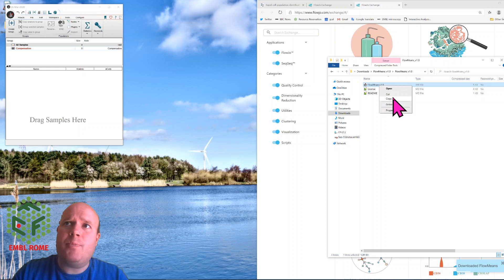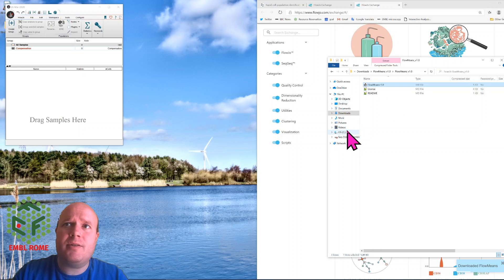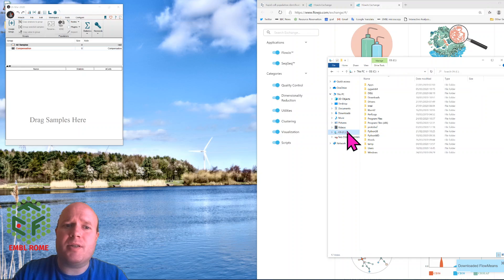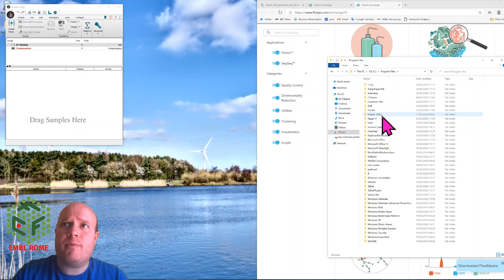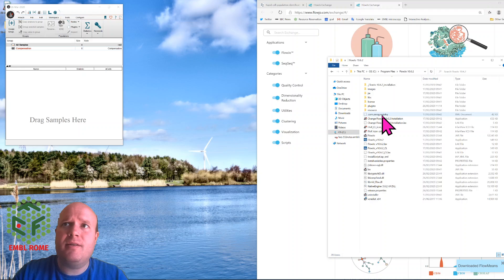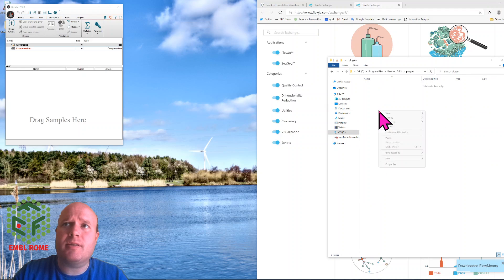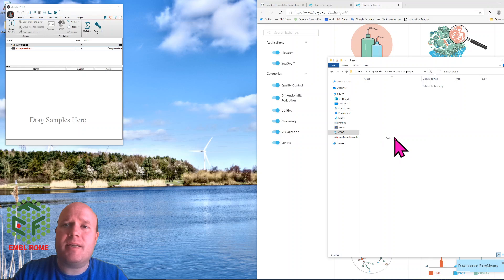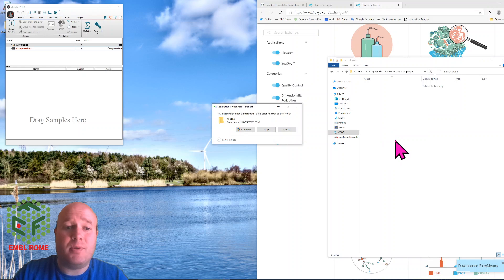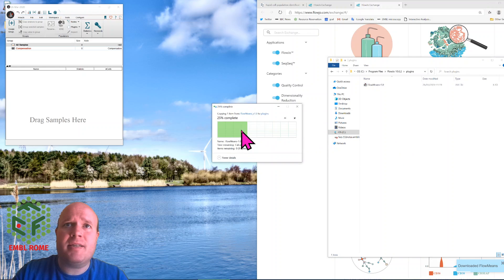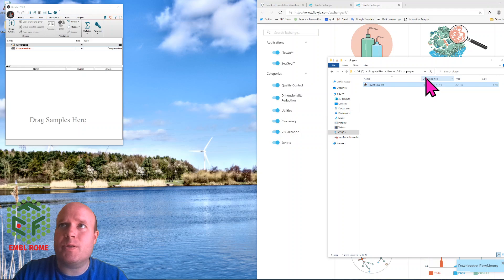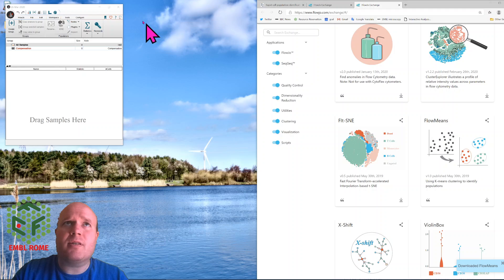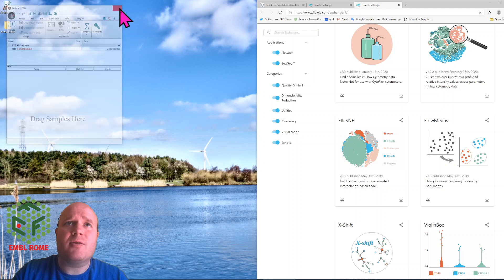You copy the FlowMeans plugin to the plugin folder of FlowJo. So in my case it's C program files FlowJo plugins. Now for your machine it might be somewhere slightly different, and Mac it will definitely be different. You need administrator settings if you're on Windows, so if you don't have to talk to your IT to help you install this. Once it's installed you have to restart FlowJo.